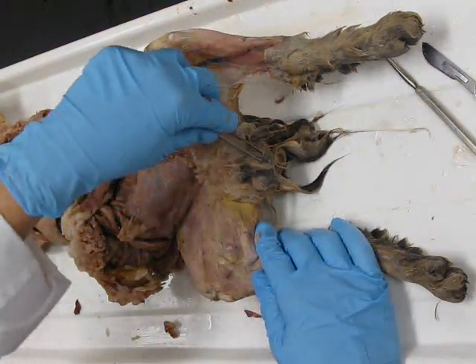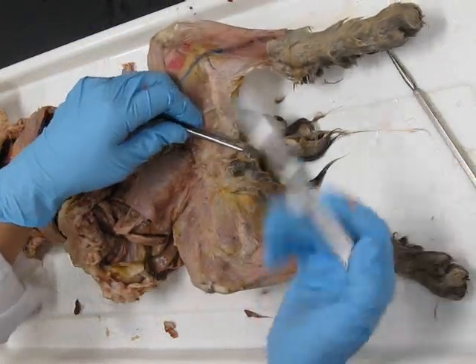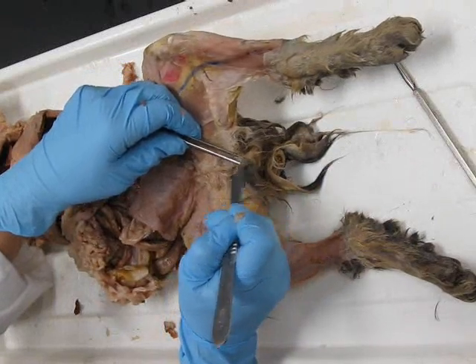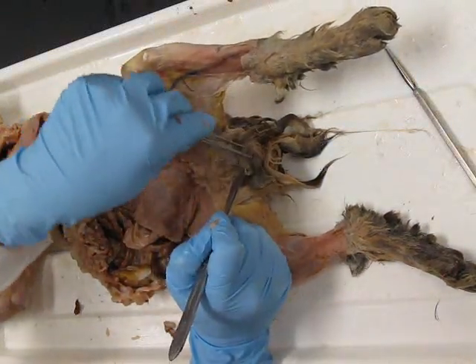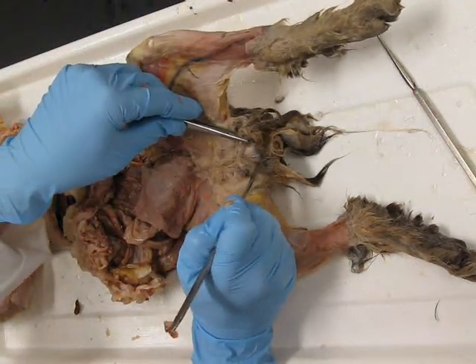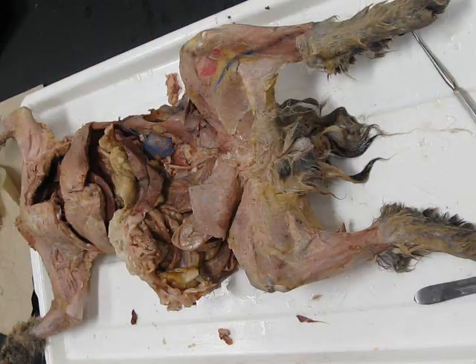And what you're going to do is hold the scrotal skin with the forceps and make a gentle incision along that scrotum. You don't want to make so deep of an incision that you cut through the testis. So superficial, move it away, make a light cut, move things.